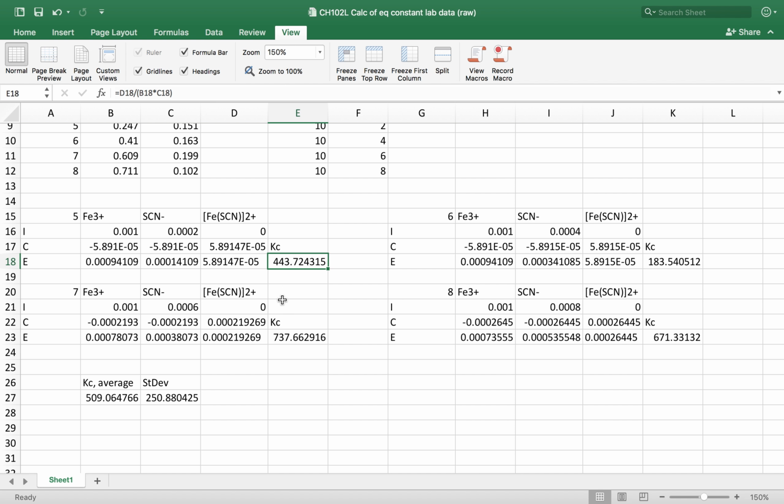Now, there's a lot of error in these experiments. This is not the best instrumentation, so we did it 4 times, and I've got 4 relatively different equilibrium constants. But notice that they're not really that far different. Even if you look in your textbooks, the equilibrium constants that are given to you usually only have 2 significant figures in them. They're usually something like 1.8 times 10 to the minus 8, or 4.7 times 10 to the minus 5, or some number like that. So when we take these and average them, we only really have 1 digit of significance.